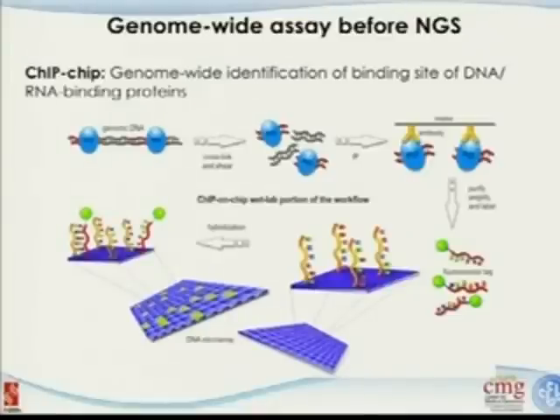So at this stage, you purify, amplify, and label, and basically you can throw out everything else because they are not on the columns you designed. And then you have these small DNA molecules. They originally bound to the protein of interest. And then you put those on the microarray platforms, trying to see which parts of the genome have been lit up.